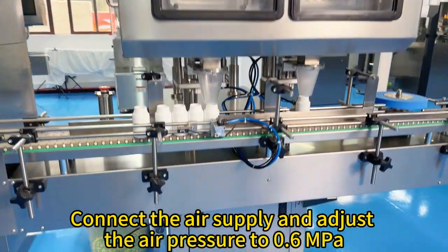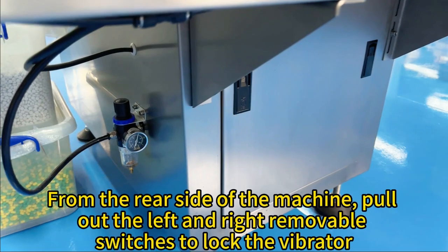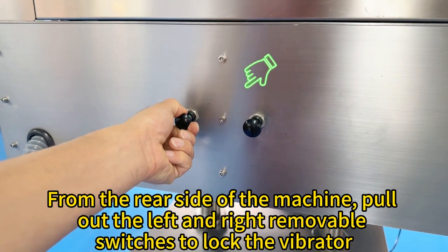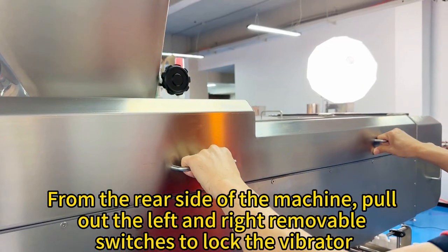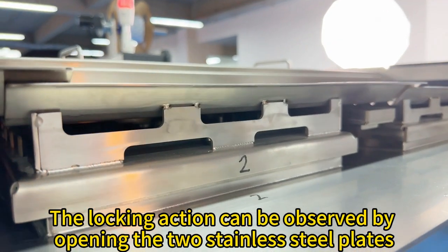Connect the air supply and adjust the air pressure to 0.6 MPa. From the rear side of the machine, pull out the left and right removable switches to lock the vibrator. The locking action can be observed by opening the two stainless steel plates.